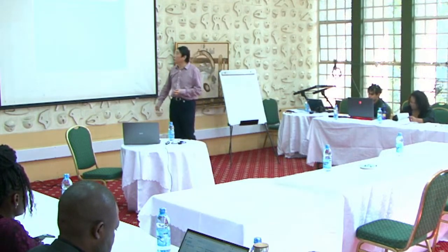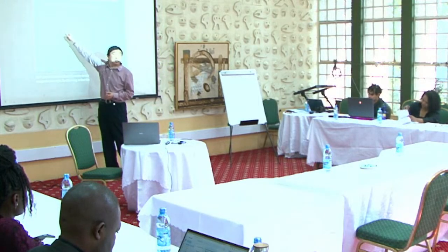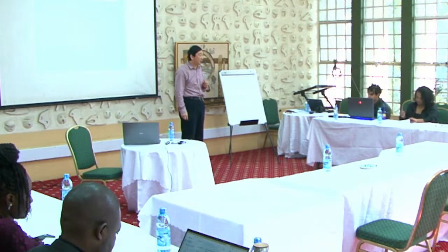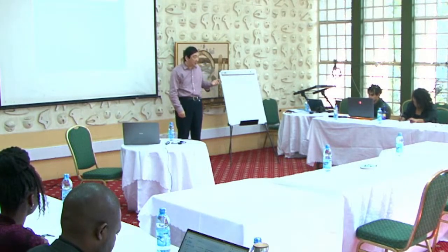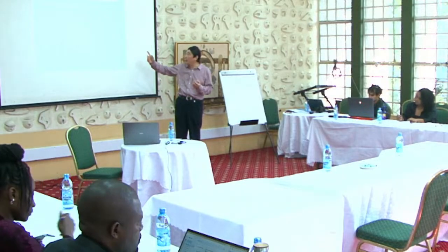Either way, that explains this even-numbered fragmentation. Since you have one double bond, you can do that McLafferty rearrangement, right? Now you see the formula is so simple. Then you can write, this is a hexene, right? 6 carbons, 1 double bond. So then you can write hexene.